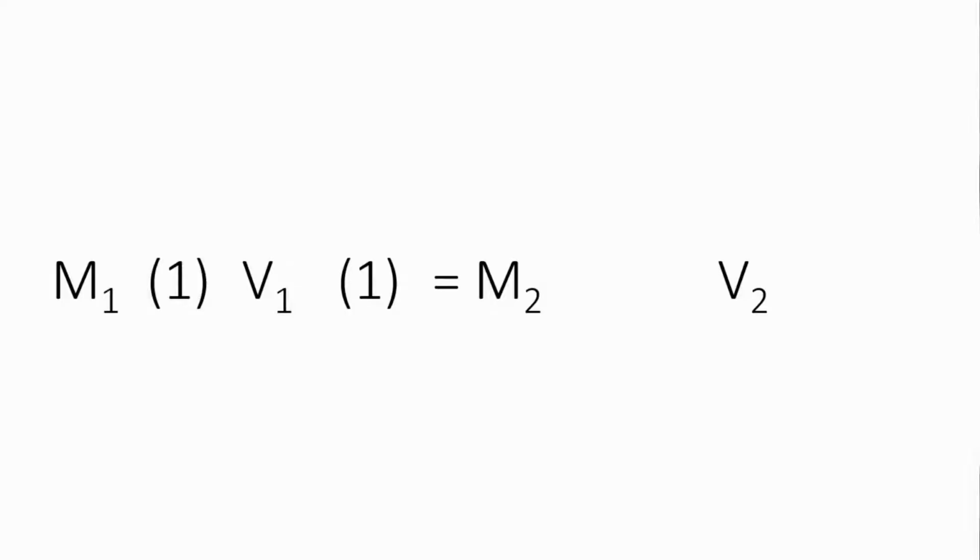But what is the effect of dilution factor variation on the readings we obtain? To explain this, let us illustrate in this way. As a solution is diluted, the absorbance of the solution is decreased. The concept of dilution relates molar concentrations and volume. If 1 liter of a 1 molar solution is diluted to 2 liters, the new molar concentration will be reduced by 1/2 as the volume was doubled.